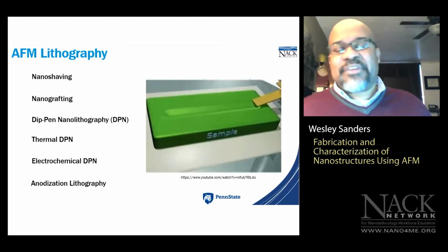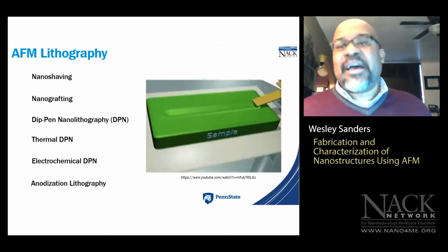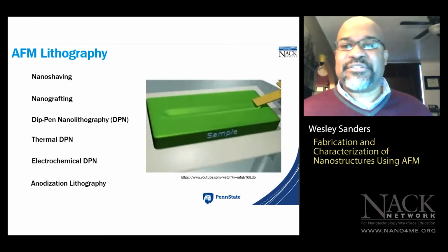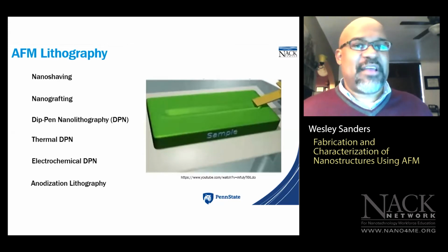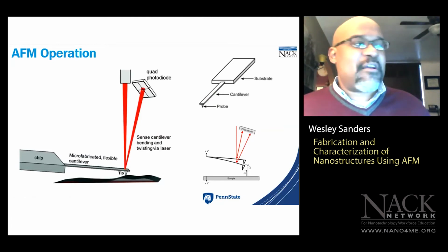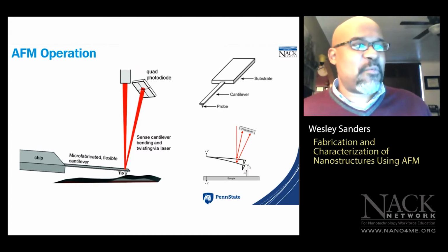Now, the purpose of this talk is not to give you an exhaustive overview of each of these topics. I just want to provide you with enough information so that you have a basic understanding of how it works and what you can use it for. At the bottom of each slide, I've included some references from the literature that you can consult if you want additional information regarding any of these techniques. So before I get to the specifics regarding nanofabrication, I just want to give you a quick and dirty overview of how the AFM works.